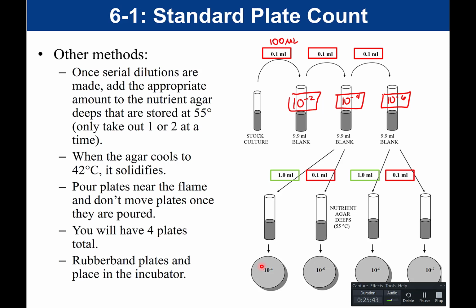And when I do this, I would set up my plates around my flame. Because remember that when my Bunsen burner is going, my sterile field is around the flame. So I would set up these plates so that the lid part is on the top, meaning the base is on the bottom, because you're going to pour the agar into the bottom part of the plate.